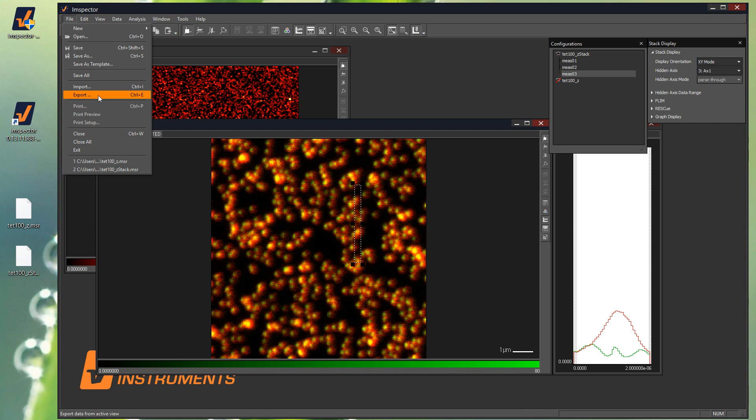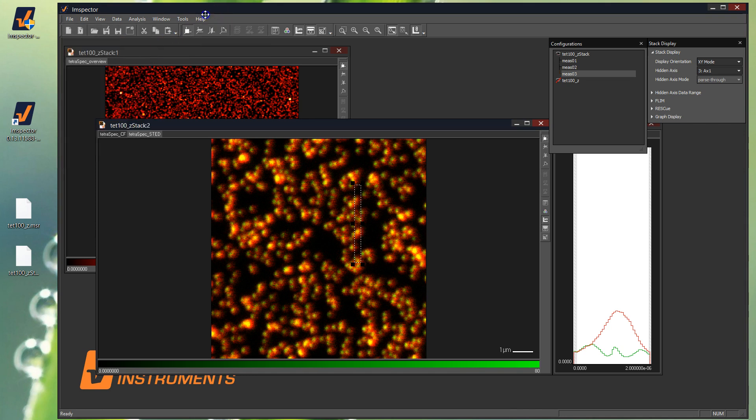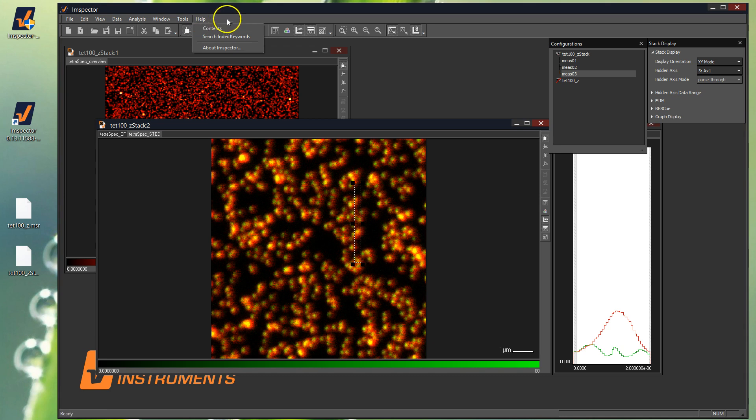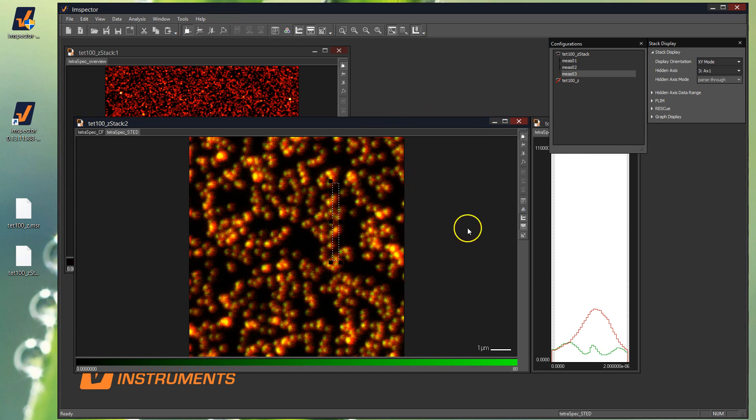So that's the basics, just opening up and viewing the files. Let me know if you've got any questions, I'll try and figure it out. The help file is pretty good. It will take you to an online document and you'll be able to go through the help. There's lots of different shortcuts and there's a kind of cool bunch of things it can do, but just for the basics, that's probably sufficient.